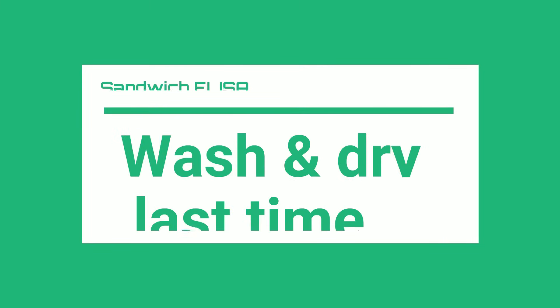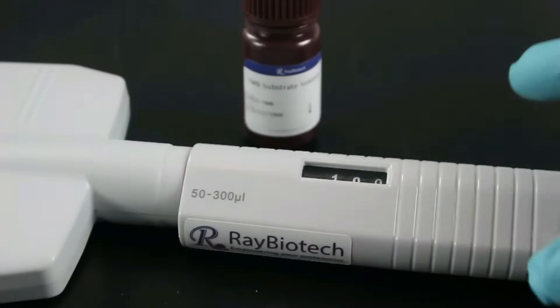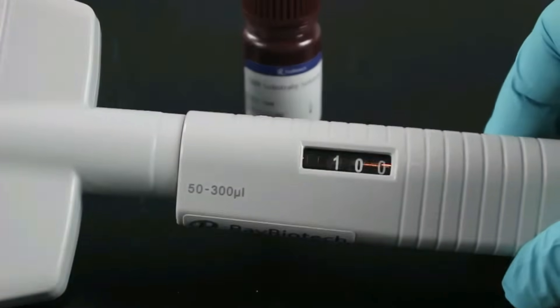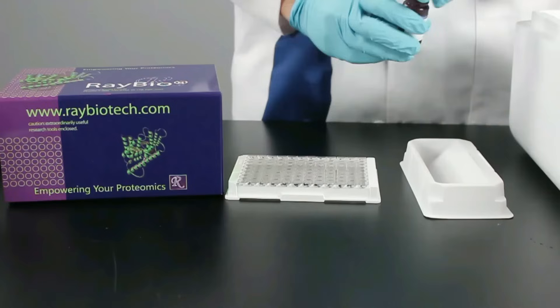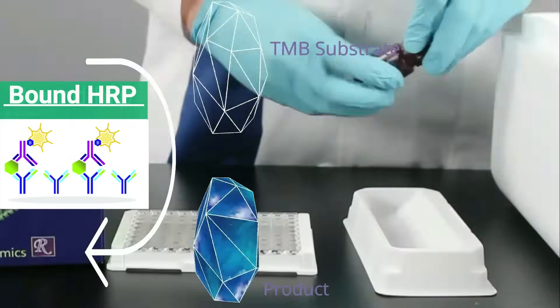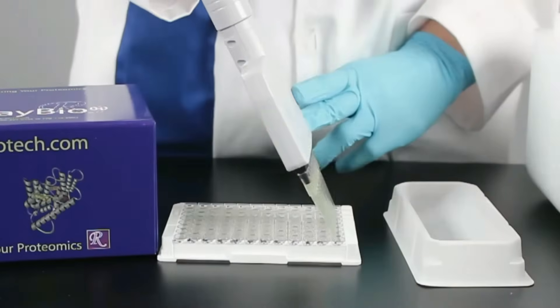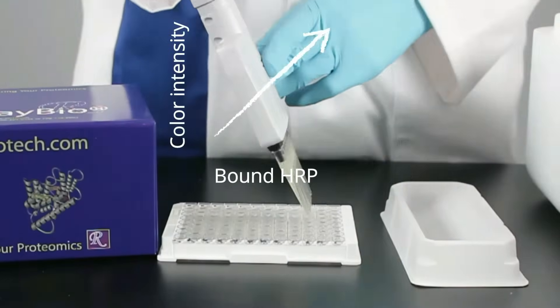Incubate covered at room temperature for 45 minutes. After this incubation, this is the last time you will wash and dry. Add 100 microliters of TMB substrate. HRP bound to the detection antibody will turn that substrate into a colorimetric product. Therefore, the bound HRP is directly related to the color intensity in each well.